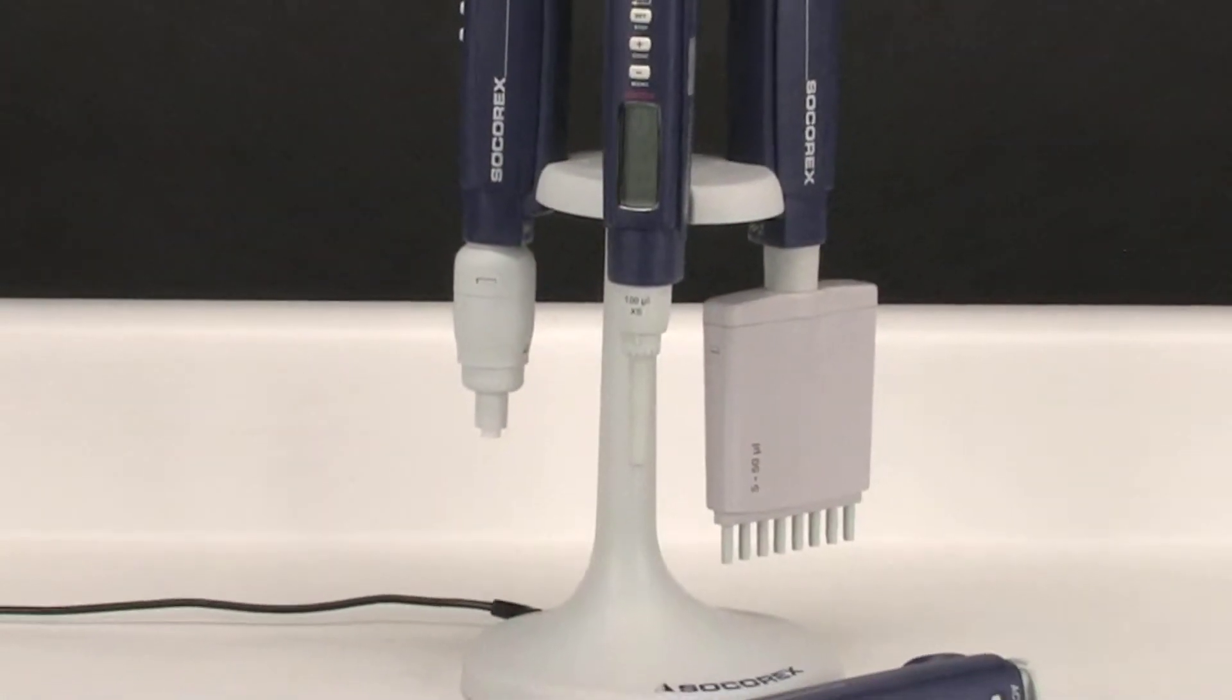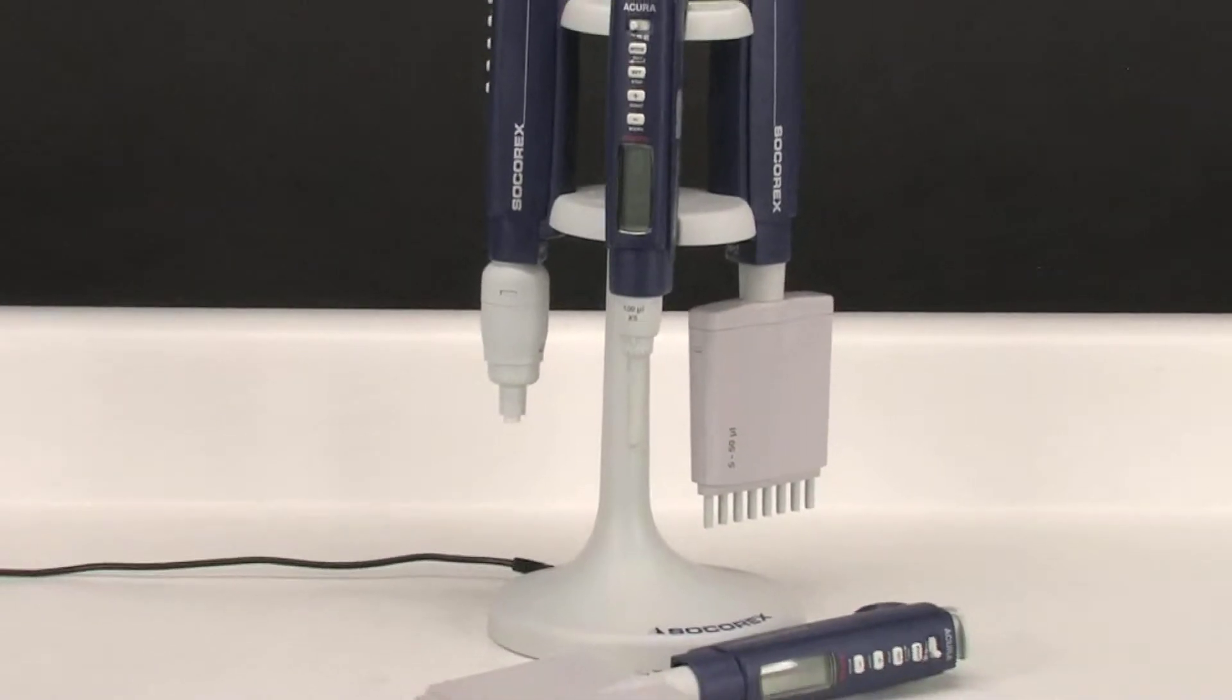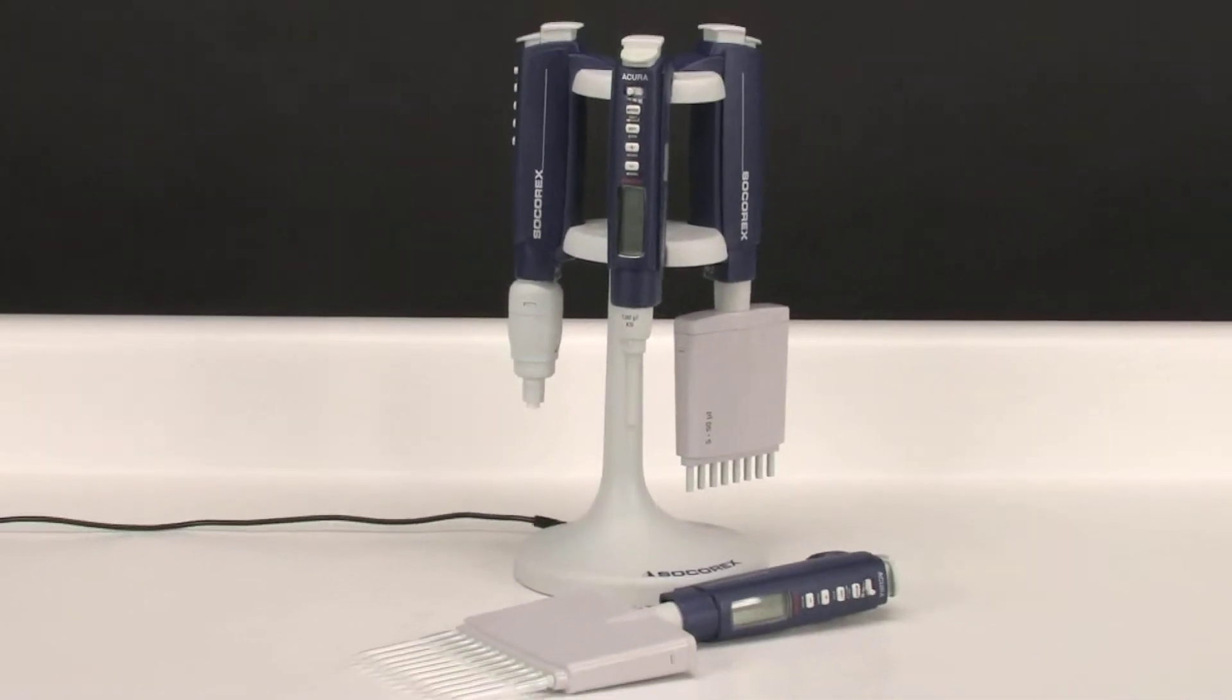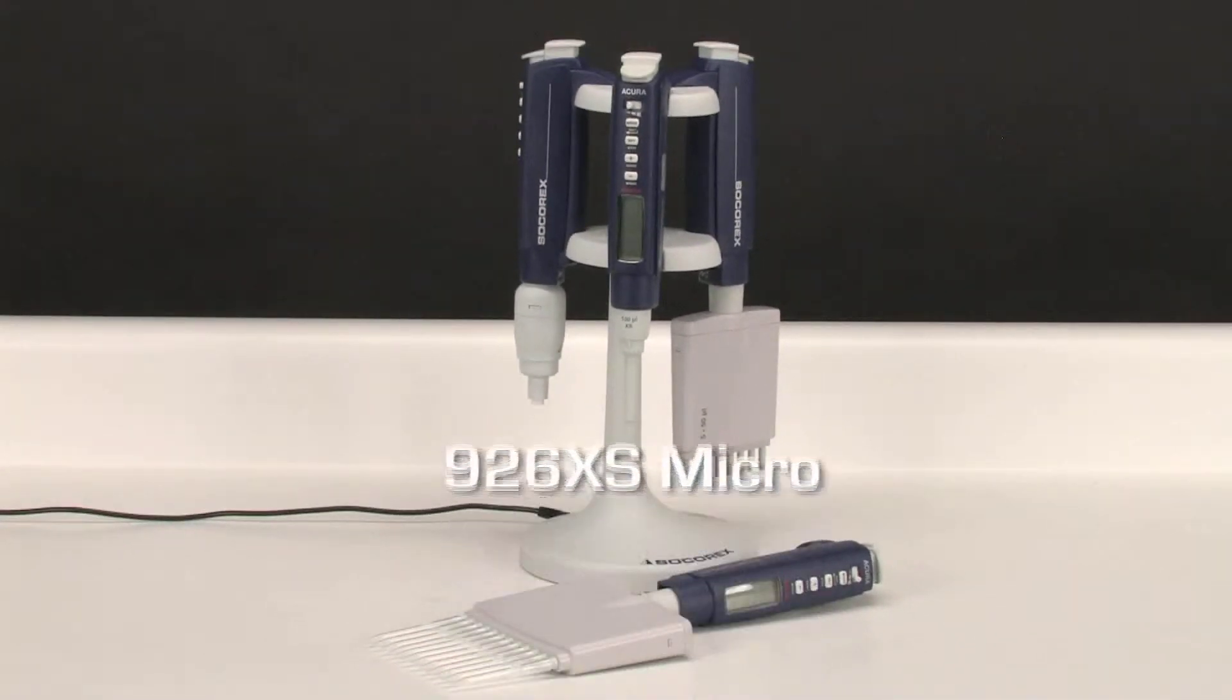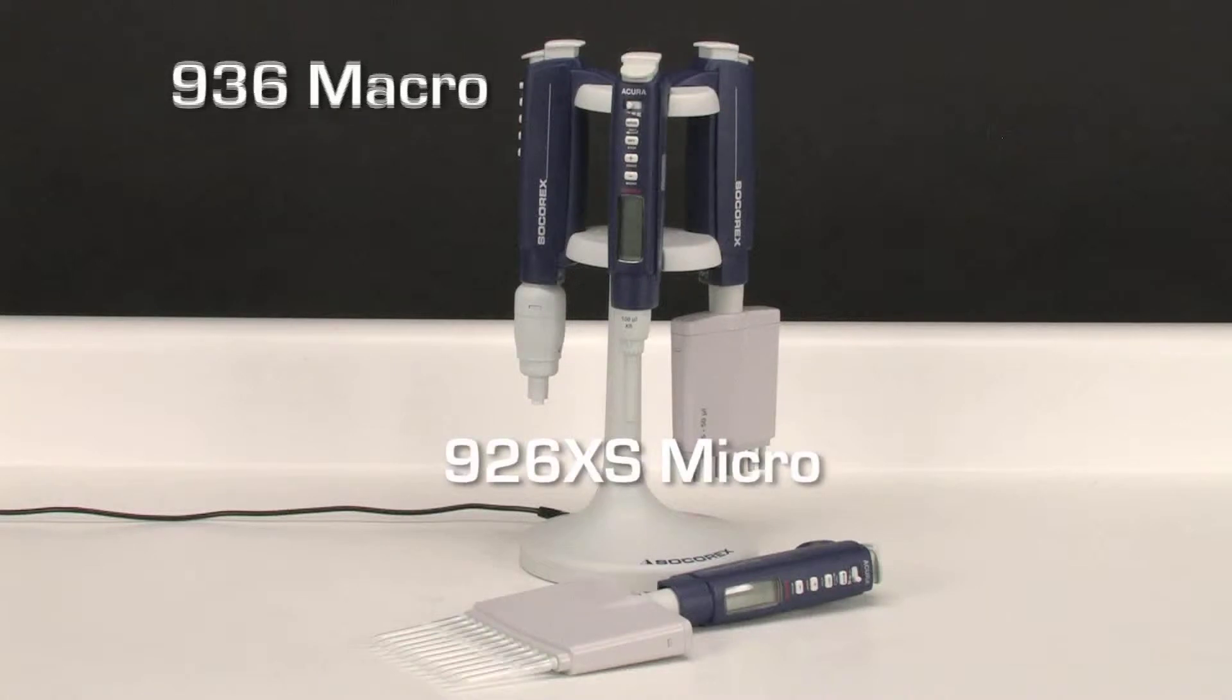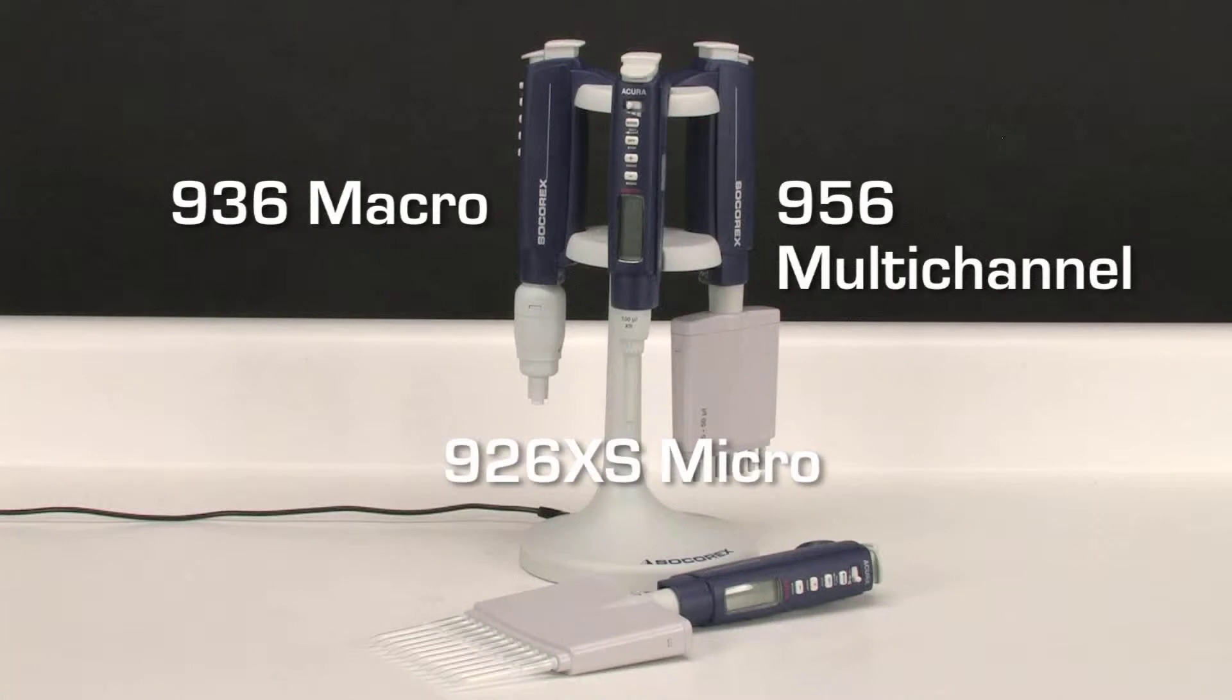The Electro series makes electronic pipetting in the lab more versatile, simpler, and safer than ever. The product line includes the 926XS micro, the 936 macro, and the 956 multi-channel models.